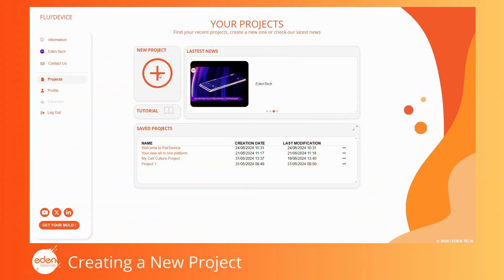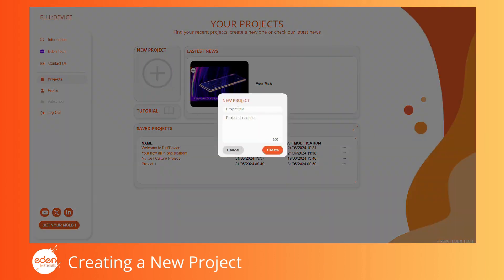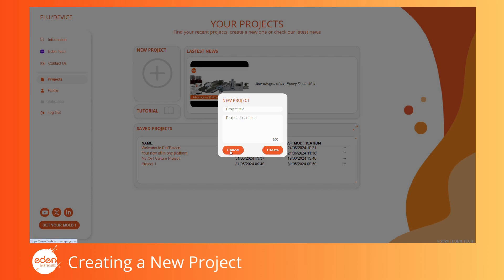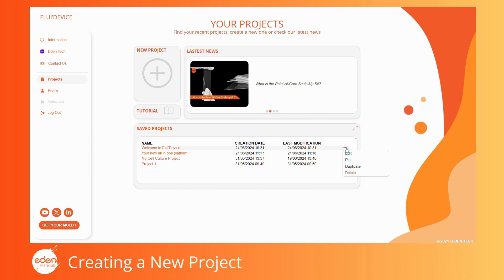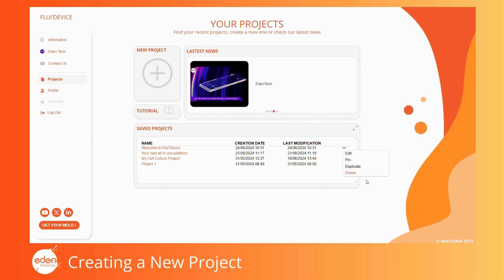Click the plus to start a new project. Give your project a name and optionally a description. After creation, all your projects will appear in the project list with their name, description, creation date, and last save date. You can edit the project name and description by clicking the option button. You can also duplicate or delete a project this way.